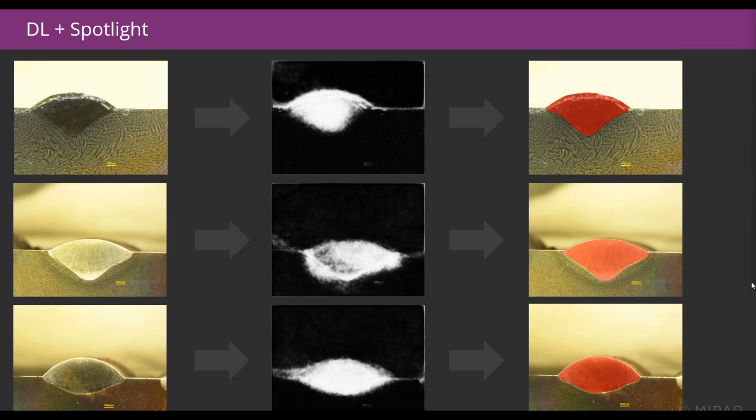Okay, our next question, how long does it take to train a deep learning Spotlight model? Okay, really good question there. Let me first make sure that there's clarity between those two different technologies. So Spotlight requires no training. It is a built-in AI model that is general enough to recognize features without needing to be trained any further on your images. Deep learning is the other form of AI that the software employs that does require a model be trained on your features.